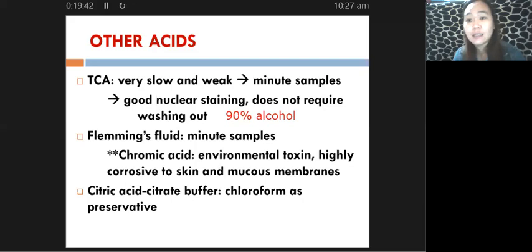after acid decalcification. So what are these? We have your Masson's hematoxylin phloxine saffron. That's one staining technique only. Please do not separate the dyes or the term. That's one term only: Masson's hematoxylin phloxine saffron. That is one staining technique that is recommended for acid decalcified tissues.